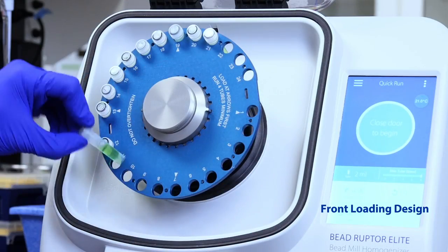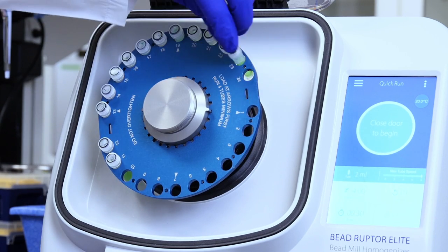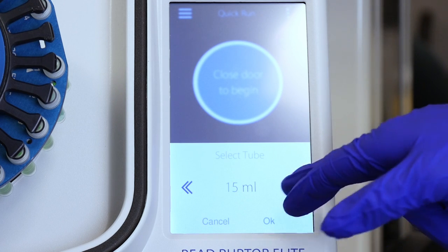Convenient front loading design for ease of use. Integrated fast and user-friendly touchscreen.